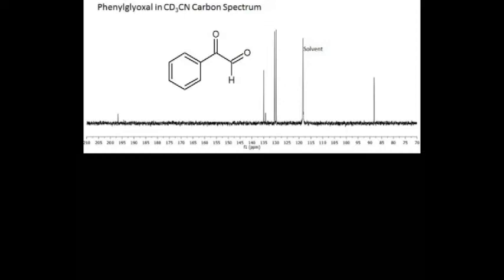And then there's this 1 carbon over here, consistent with an aldehyde, about 190, a little bit above 195 ppm. It's small, but it could be consistent with an aldehyde. And then over here on the other side, we have this 1 carbon at around 87 ppm. Not a common area for chemical shifts. Not quite sure when we were first running that what that one was.